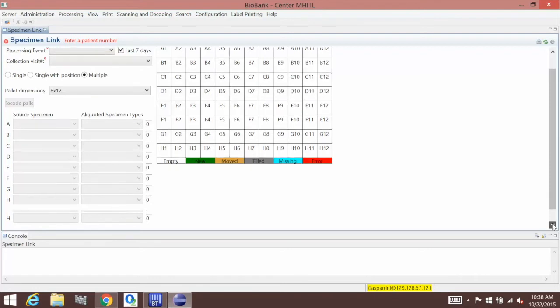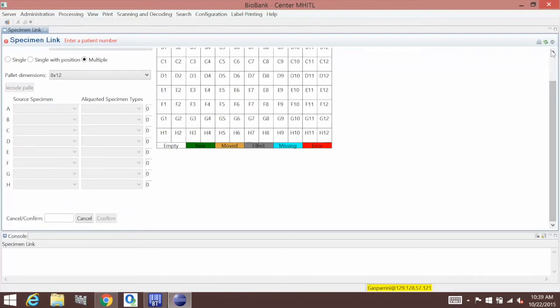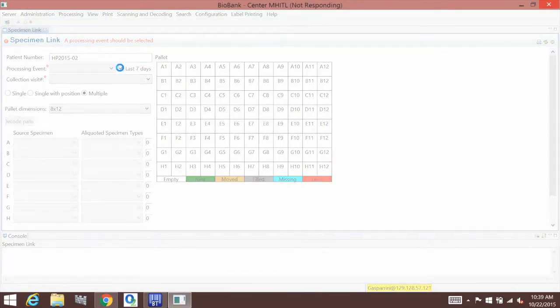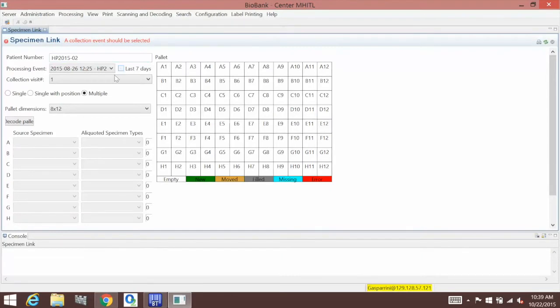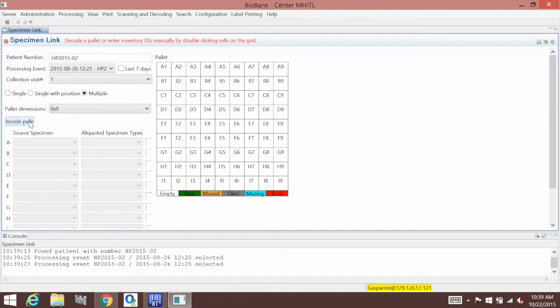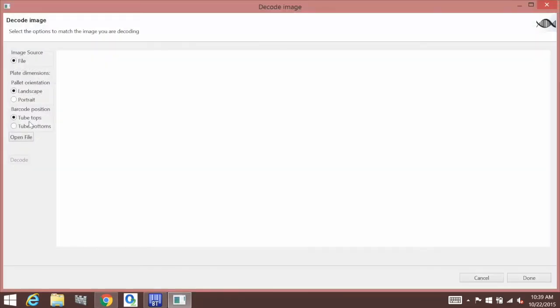Once we obtain all of our biopsies, we then need to link those samples to the labels or the tubes that we put them in. So this is called the specimen link. So here we're just simply linking that sample tube to the specific sample. For example, formalin. A formalin sample, for example, that we have obtained.